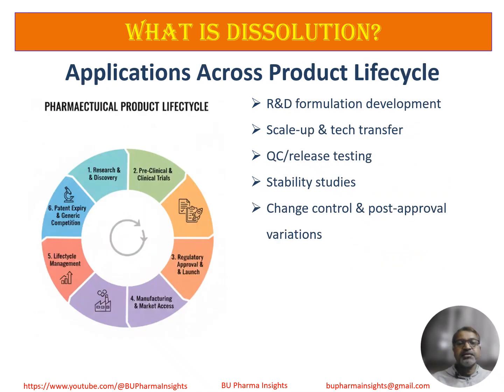Next is application across the product life cycle. Dissolution is not just a QC test, it is used throughout the entire product life cycle, from formulation development, scale up, and technology transfer to routine QC testing and stability studies. It also supports change control, post-approval variations, and even bioequivalence predictions. So, dissolution plays a role in almost every stage of the drug journey.